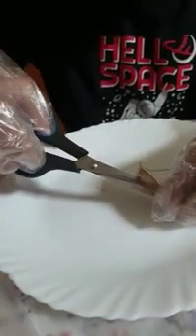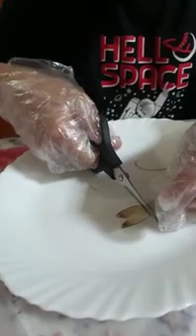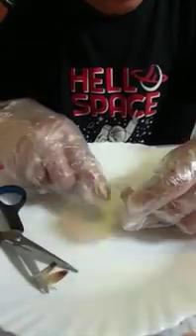and if we cut this part, we will know where the tendon is. The tendon, as you can see right here. Cut this part. As you can see, this is the gelatin-like tendon, and it lets it flap the tail.